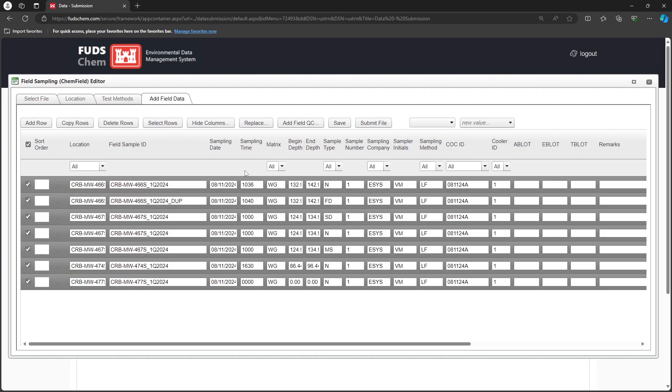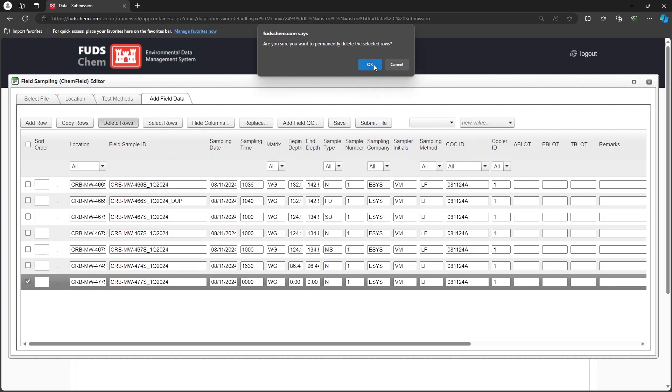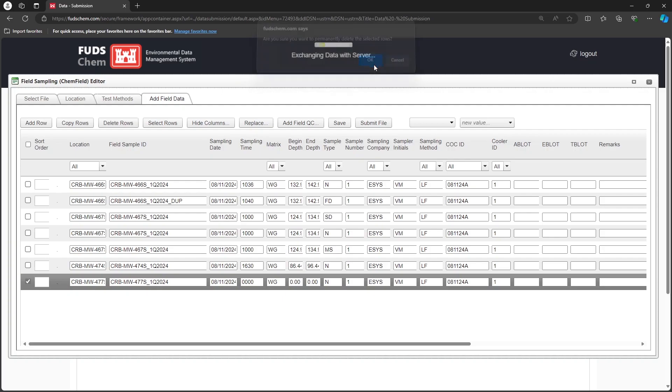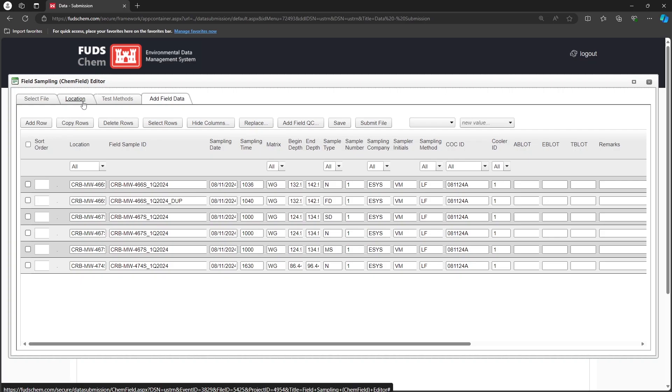Let's say our field team was not able to sample 477S. We can delete it from the chem field by selecting it and clicking the Delete Rows button. This will not remove the sample from event management, so FUDsChem's event tracking reports will still show that it was planned. If the sample is collected as part of a different CoC, we'll be able to add it to another chem field file later.